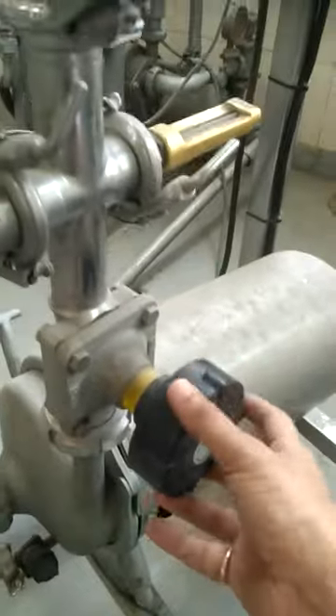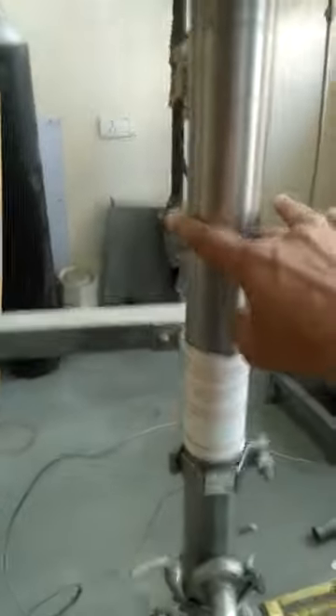Via this control feed valve and this temperature gauge, we can know the temperature of the feed. This is the main membrane, which is a tubular kind of ultrafiltration membrane.